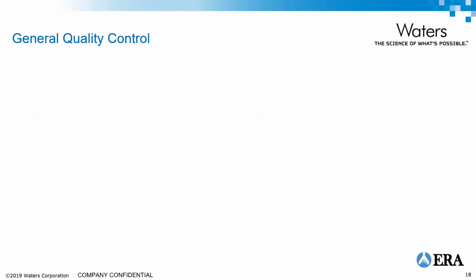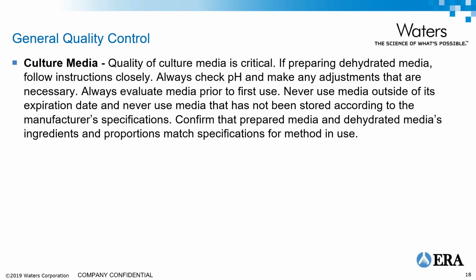Okay, let's go on to general quality control. So culture media, the quality of the culture media is probably one of the most critical aspects of running these samples. If you're making it from dehydrated media, you want to follow the instructions closely. Always check the pH, make sure you make any adjustments. You also want to evaluate the media after you've made it up. Make sure that this batch of media is at least as good as the last batch of media.